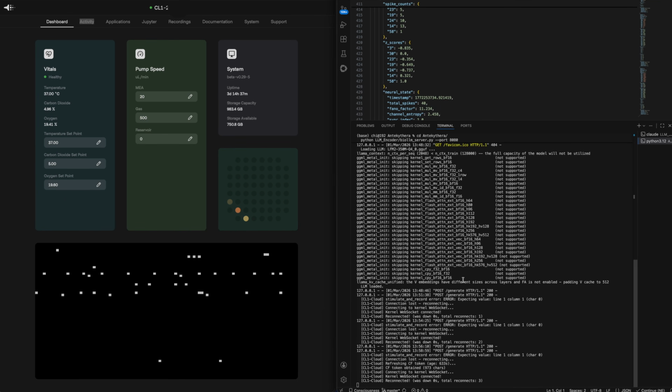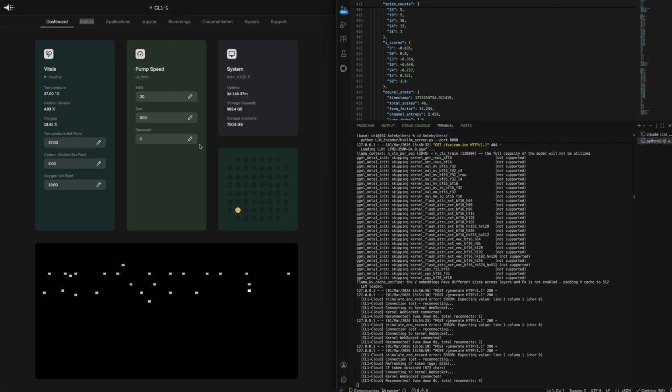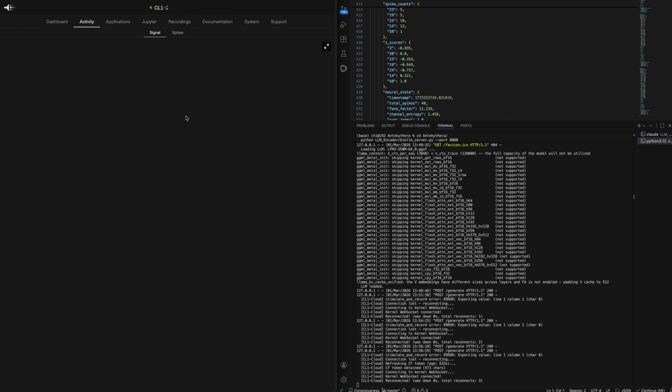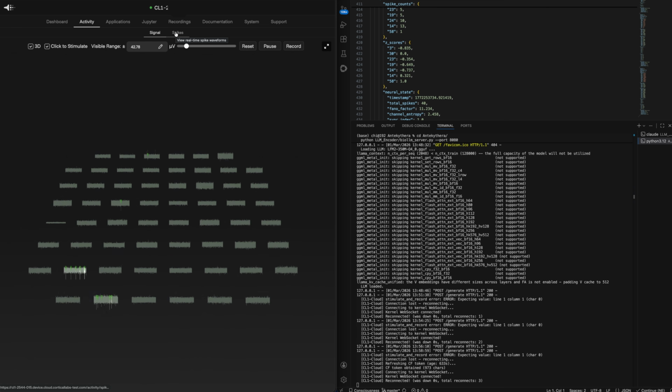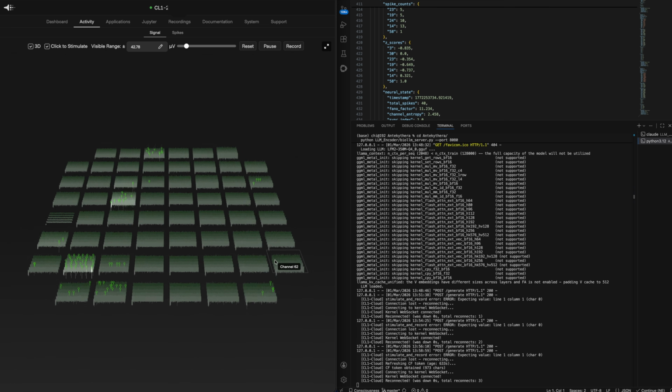All right. We're just getting under the hood here of the BioLLM project. This is basically using the Cortical Labs CL1 to encode the token selection in a very small 350 million parameter LLM that is running locally on my machine. So we're going to get under the hood here. You can see the visualizer. I went into this in my last video.